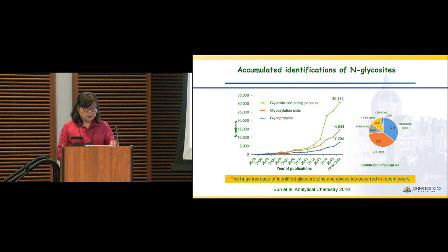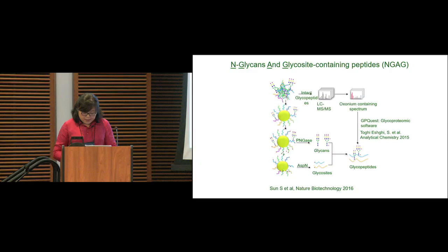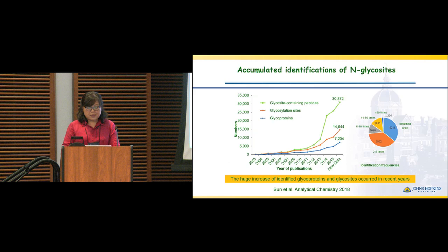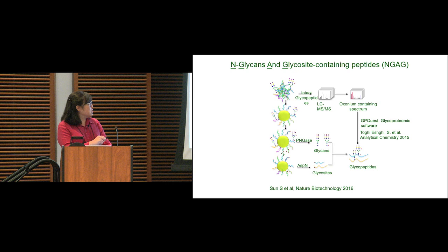In that particular approach, when I was attending the first glycomics meeting organized by one of the great glycobiologists, like Taniguchi in Japan, I realized that everyone actually analyzes the glycan. In this approach, we released the peptide and left the glycan on the bead. We thought to further investigate this. So since Johns Hopkins, we try to investigate the glycosylation part of it.